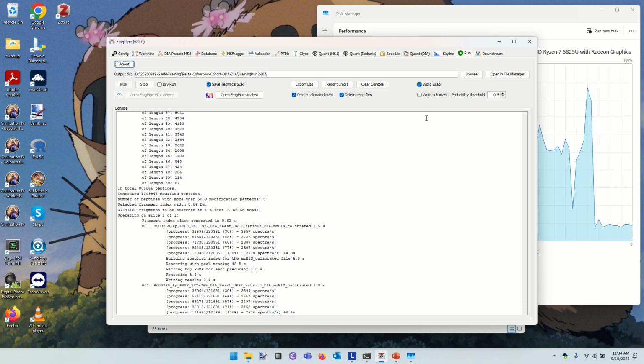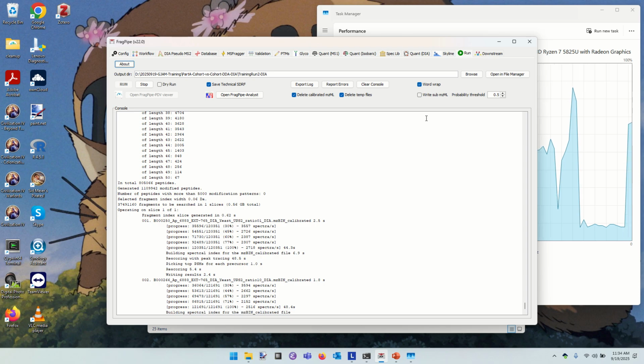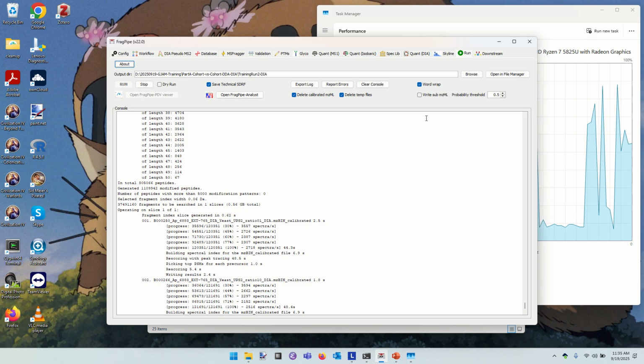So I have the 30 seconds in which I can identify and maybe quantify peptide A, and they overlap by 15 seconds with the 30 seconds in which I can see the ions of peptide B. If I have multiple snapshots during that overlapping time, what I see is peptide A going away, but peptide B coming on strong.